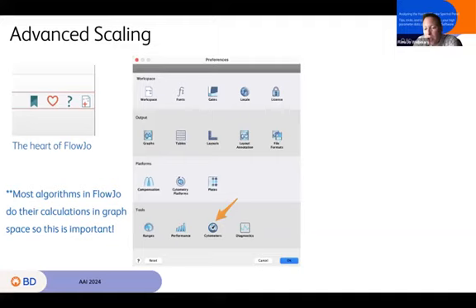And so you can get better results if you do things like minimize how much of your data range is attributed to the negative population, where variance across the negatives is probably just differences in noise and not something that you want to focus, say, a clustering algorithm on, finding the differences that are just based on differences in negative signal, or the full range of your signal. How different are two things really? Most clustering algorithms, dimensionality reduction algorithms, and so forth are very simply just trying to put things that are like together and things that are different, spread them apart. And if you trim out the white space at the top and bottom of your ranges, well, then things will look more different, if they really are very different, as opposed to a whole bunch of white space occupying all your space and all your data is somewhere right in the middle of the plot and then it all looks similar. So that's my spiel on why this is really worth taking a moment to do.